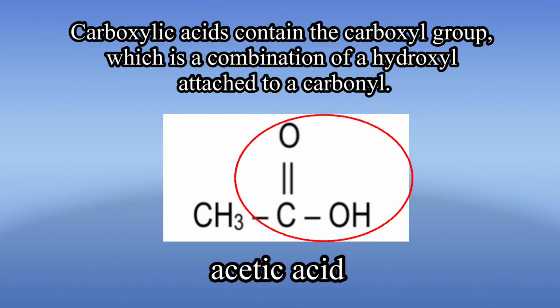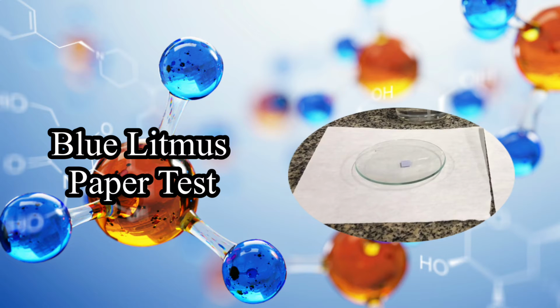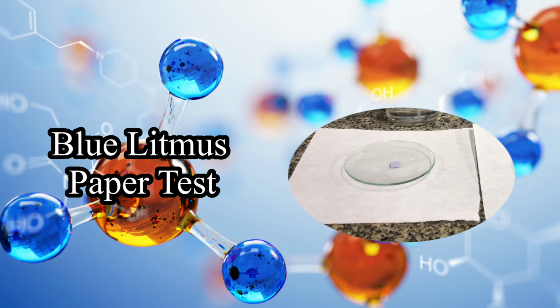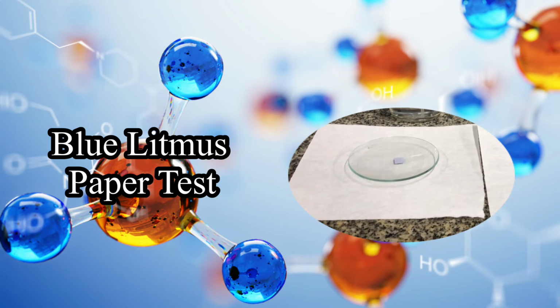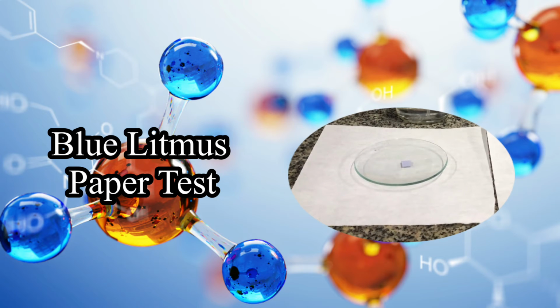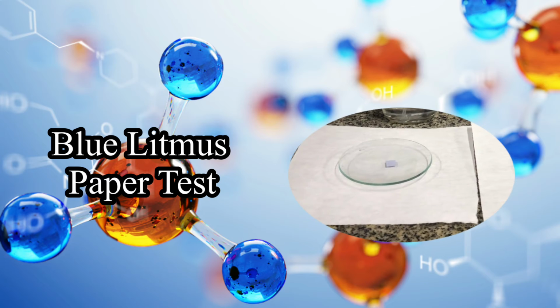This acidic property of carboxylic acids makes it easy for us to differentiate it from the rest of the functional groups, as we shall see in the following tests. The first test is a very simple blue litmus paper test. As we already know, blue litmus paper will turn red upon contact with an acid. Thus, the same reaction is expected for carboxylic acids having acidic properties.